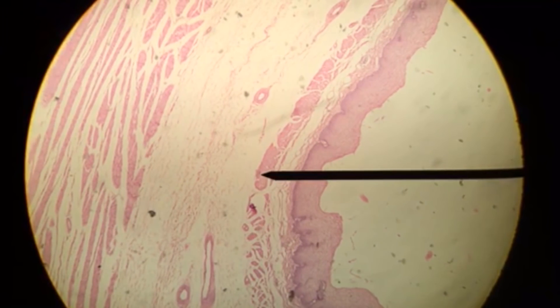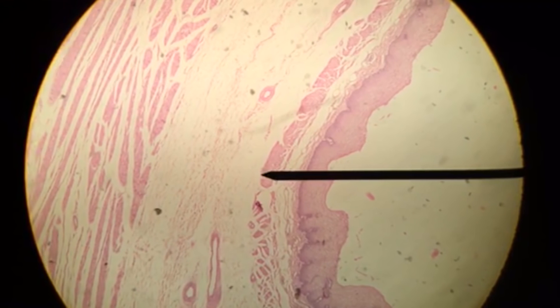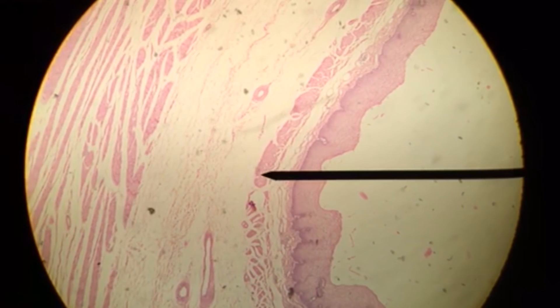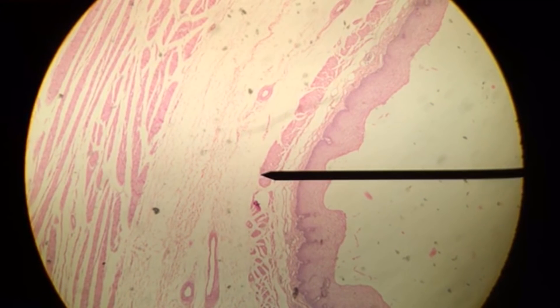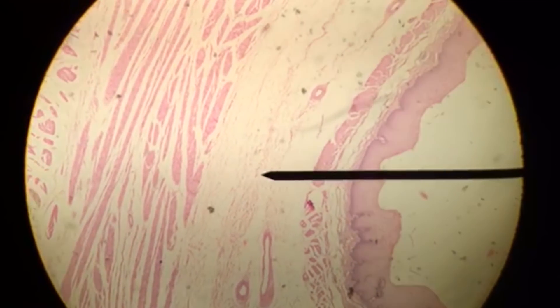The layer that the pointer is on now is still part of the mucosa. It is the muscularis mucosa. Again, do not confuse this layer with the muscularis. This is still part of the mucosa.